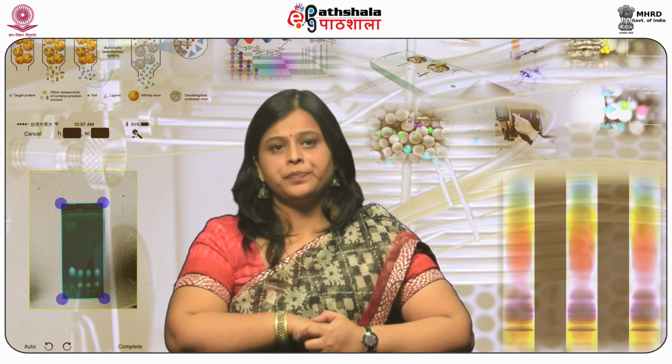Nowadays, supercritical fluid chromatography using pure supercritical fluid as mobile phase is rarely employed. Methanol is amongst the most commonly used polar fluid that is completely miscible with carbon dioxide and used as the modifier.